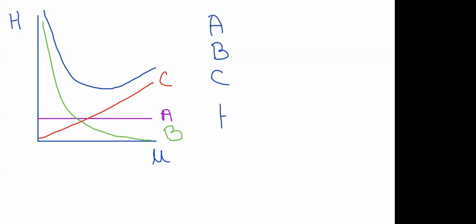And it can also be written as a general equation where the theoretical plate height is expressed by all of these terms, and the generic form looks something like this. So it is independent of the eddy diffusion, but inversely proportional to the longitudinal diffusion and linearly proportional to the resistance to mass transfer.